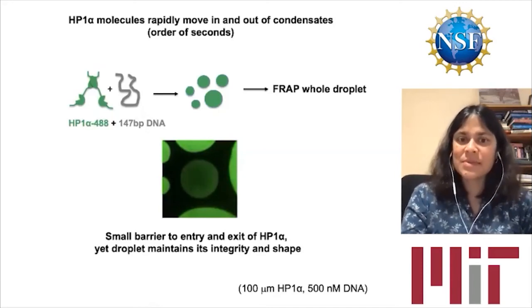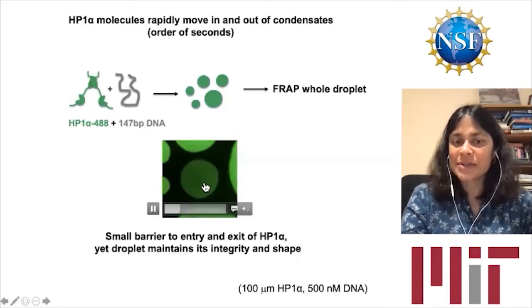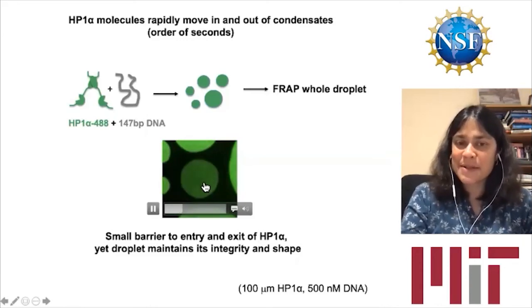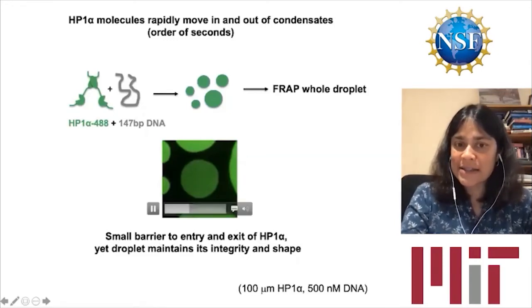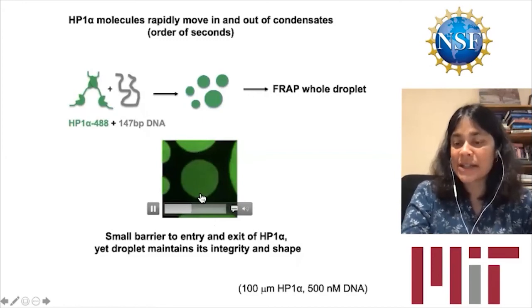Within seconds, HP1 molecules have recovered. Okay. Now, what is interesting about this simple experiment is that you can see that there's a very small barrier to the entry and exit of HP1 alpha molecules, yet the droplet maintains its integrity and shape.